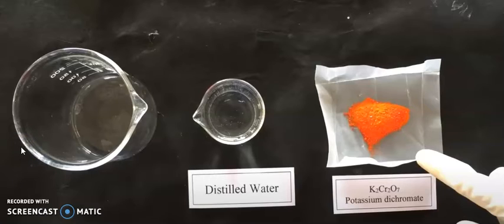Today in this video, we are going to learn about making chromic acid. So how to make chromic acid and what is the utilization of chromic acid. So let us start learning the making of chromic acid solutions.